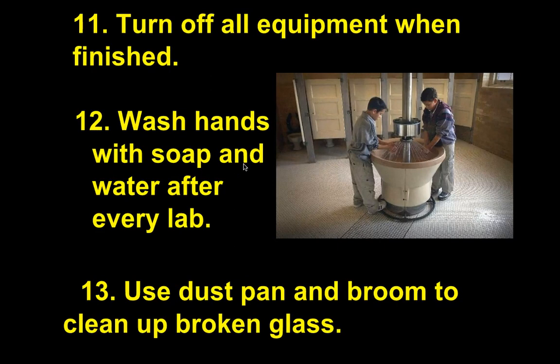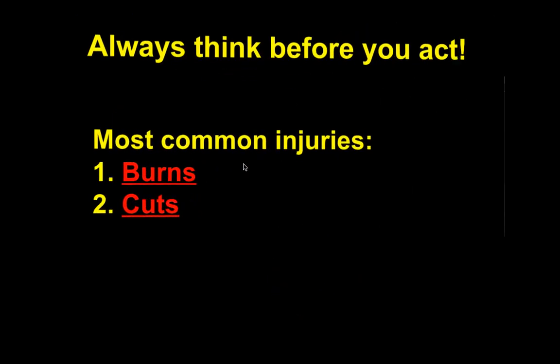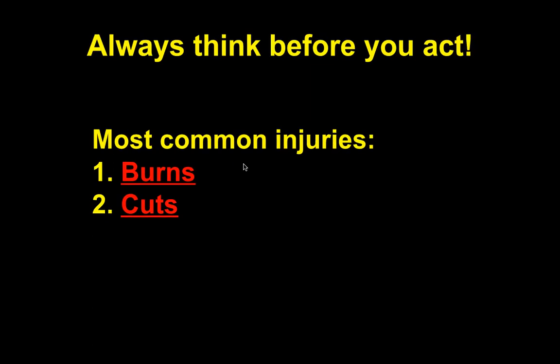Turn off all equipment when finished. Make sure you wash your hands with soap and water, and use the dustpan and broom to clean up any broken glass. Always think before you act. The two most common injuries in the lab are burns — usually from lighting a match, since many students struggle with paper/cardboard matches — and cuts. Make sure you have everything filled out on your notes. You will be tested on this, and you must pass the test to do certain labs.